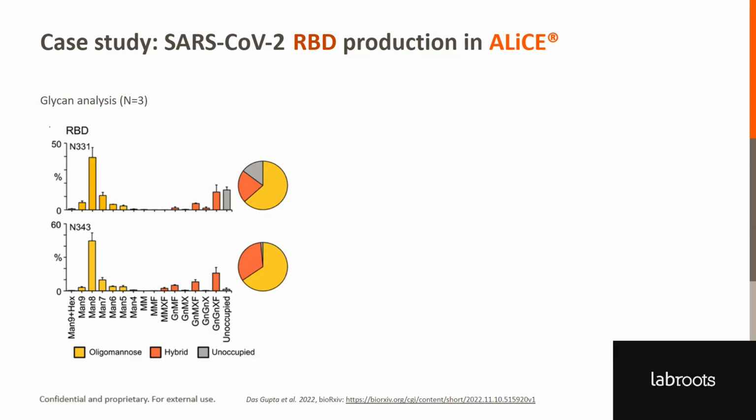Going again to characterization of the protein. From these larger volumes, we purified the protein in this context just by Strep affinity. Strep-tag II is located on this fusion protein. And taking it for the glycan analysis, we could again see quite reproducible glycosylation from 3 different batches of the RBD, produced from 3 different batches of the lysate. You can see as well here some more plant-type glycan structures in orange. This is coming from our plant-derived system, and is quite typical to see. There are more complex glycosylation engineering projects that we are furthering internally at the moment.